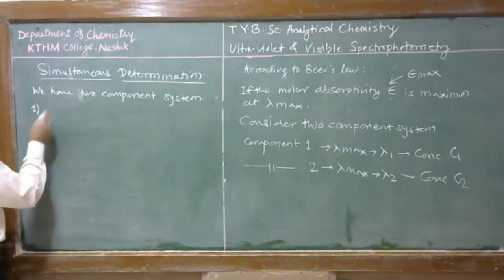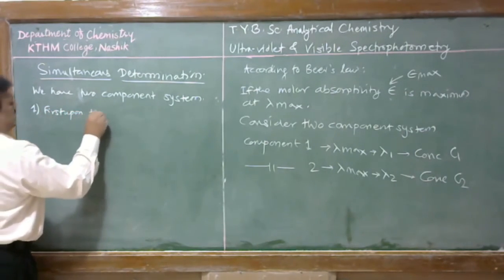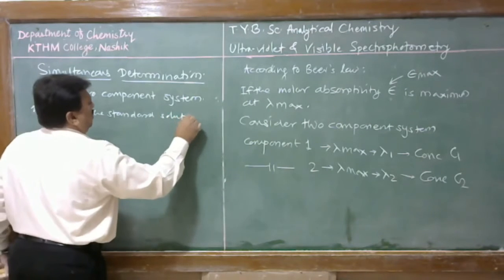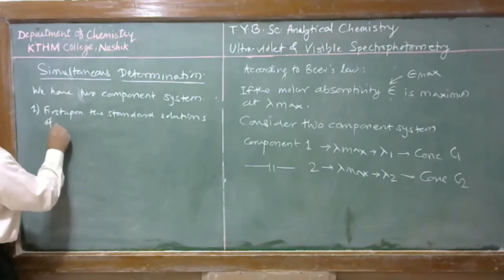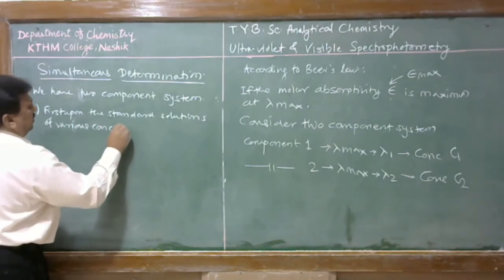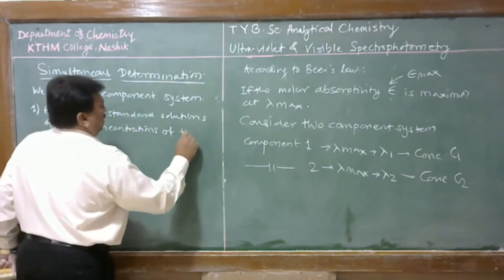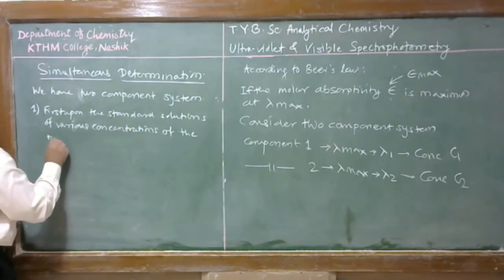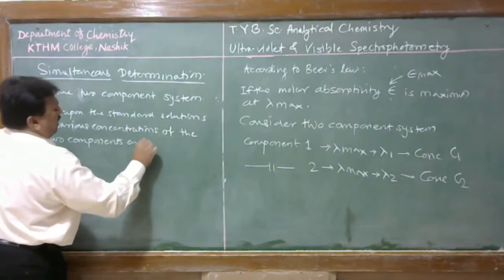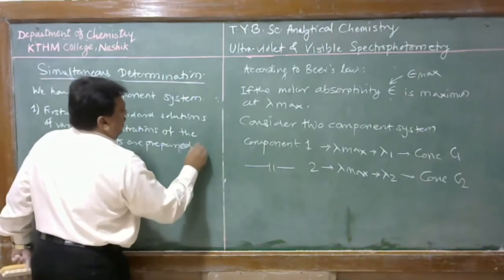For this purpose, in the first step, standard solutions of various concentrations of the two components are prepared separately.